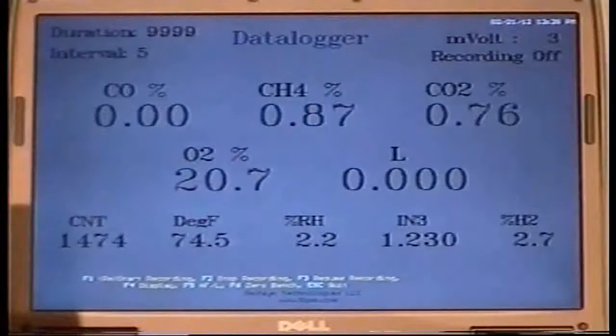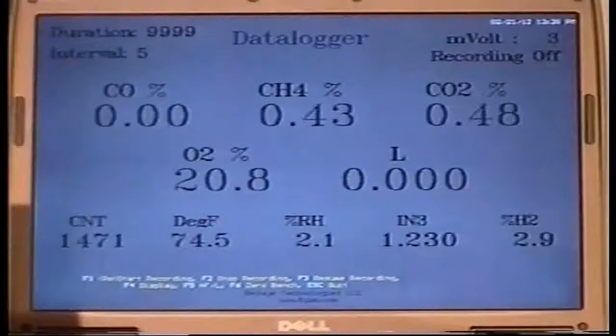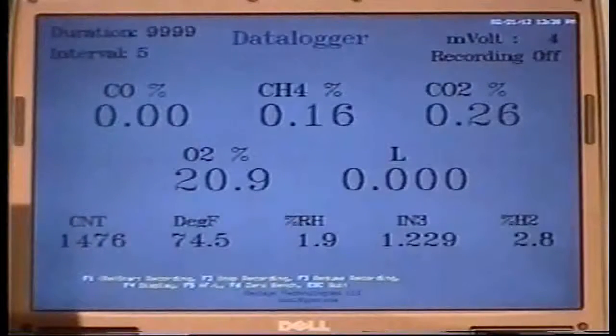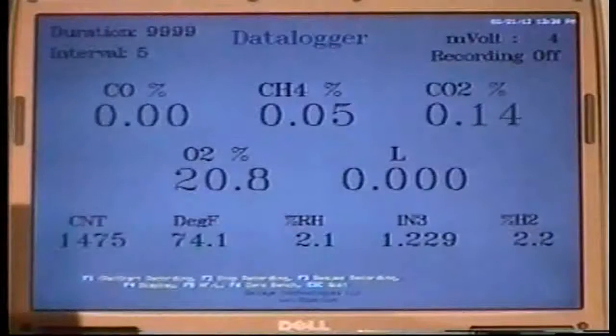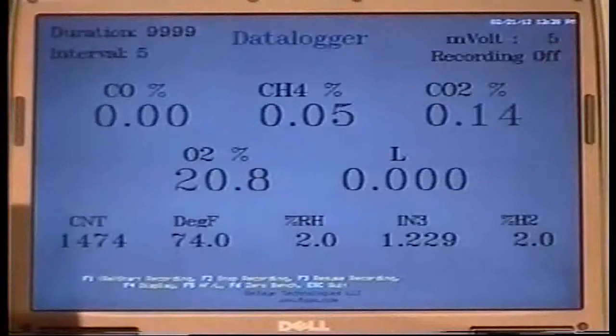use the pump to zero out the analyzer, turn the pump off, and then hook the analyzer up to, say, a peristaltic pump, or in a case a month ago, we didn't even have enough headspace for a peristaltic pump. We ended up using a 60 cc syringe and injected the sample directly into the analyzer using the syringe. It only took 2 loads from that 60 cc syringe to completely fill the sample chamber and the rest of the sample system, and we got very accurate information.